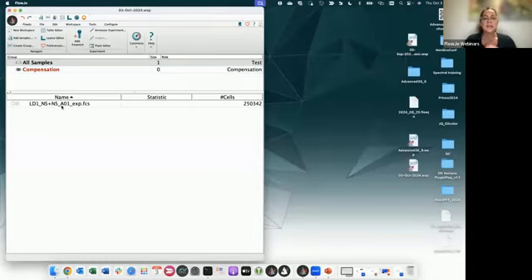A template is a workspace that has defined gates and defined layout settings, and you can use it to analyze new samples every time. So it's like the templates that you have in PowerPoint or Excel or Word and so on. It's something fixed that you can use to analyze new files every day. Now, in order to have a template work, you need to have a gating strategy.